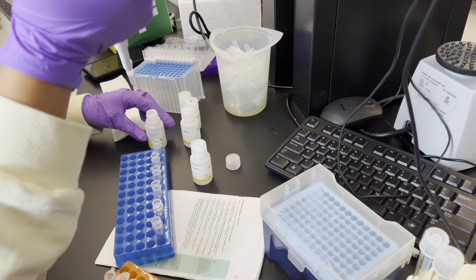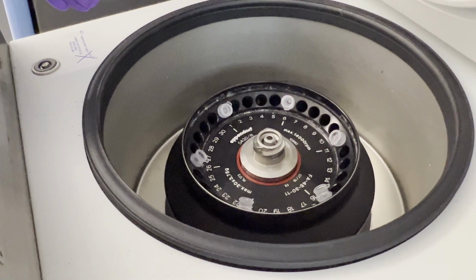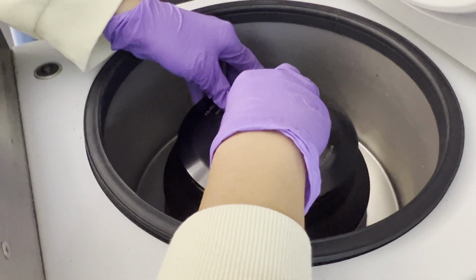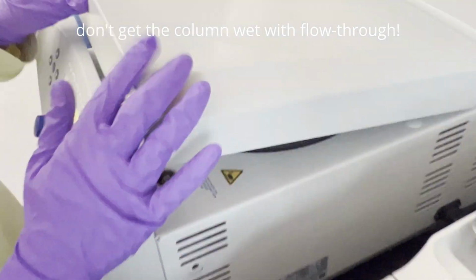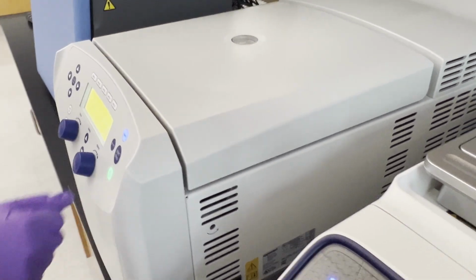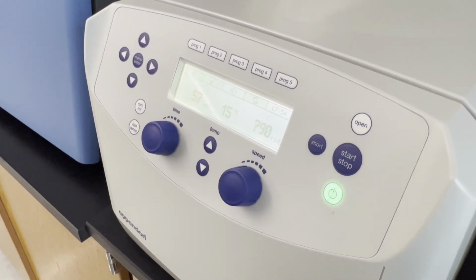Often you need to add ethanol for wash 2, and if you don't add it, you will wash your DNA away when you use this. Also, if the flow-through makes contact with the bottom of the column, the contaminants will touch the DNA. So make sure that you empty the waste in your collection tube and spin again if you think that the column is still wet.